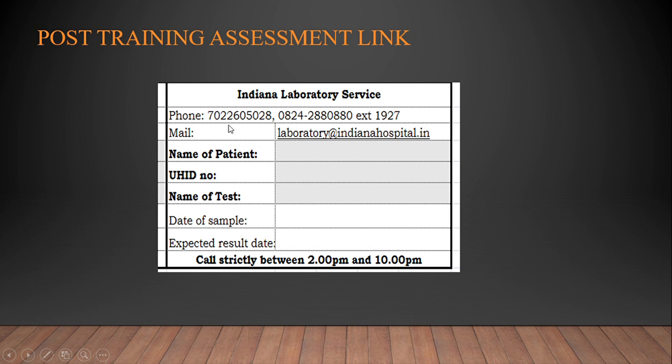This is the phone number of the lab, and this is the extension number of the lab, so they can call and ask us whether the report is available or not, and they are instructed that they should call between this particular time only for inquiring about the report. So this also you should fill.